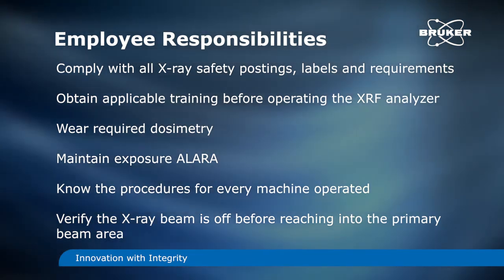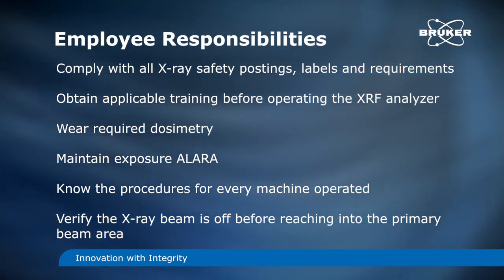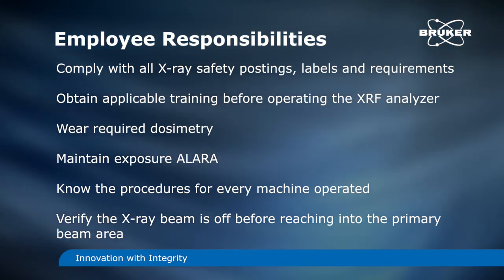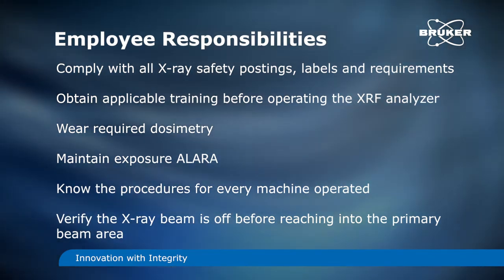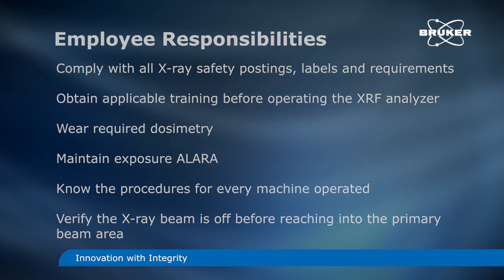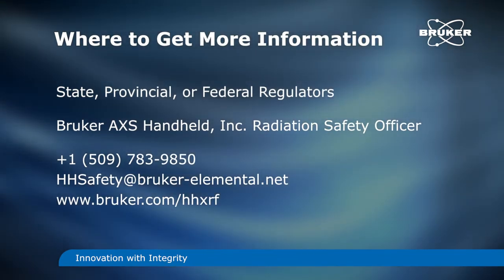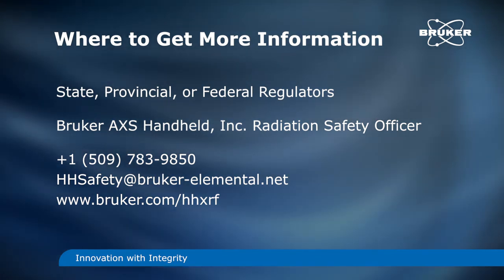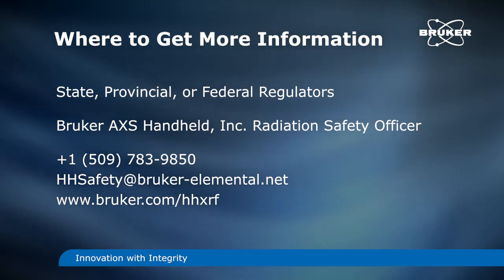The employee has the responsibility to comply with employer X-ray safety postings and requirements. Obtain applicable training before operating the XRF analyzer. Wear required dosimetry. Maintain exposure ALARA. Know the procedures for every machine operated. Verify the X-ray beam is off before reaching into the primary beam area. For more information on registration and regulatory requirements specific to your area, contact your state, province, or federal regulators.